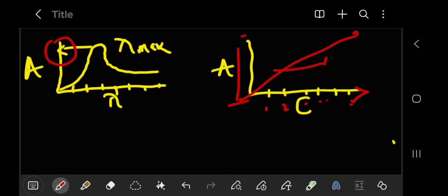So remember, the slope is your molar absorptivity, all right? Path length usually varies, but you should also know the path length. Then you calculate the molar absorptivity at each concentration. So that means you're going to have a table that shows the different concentrations.